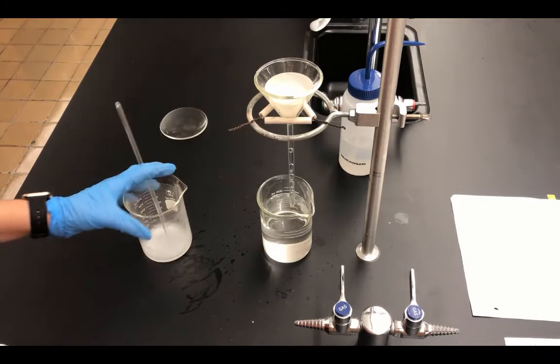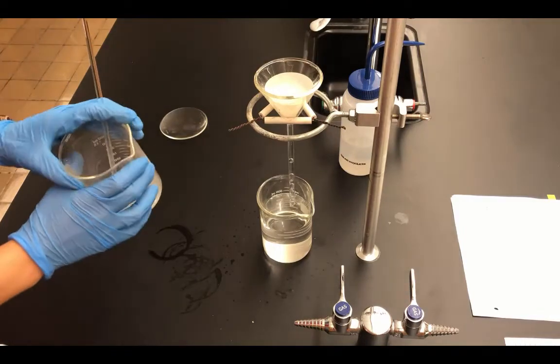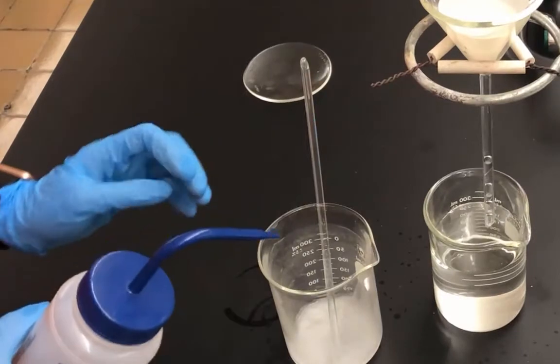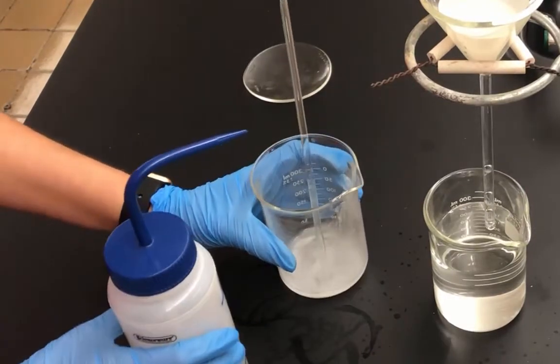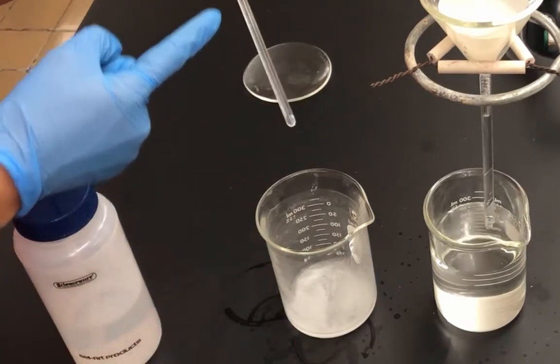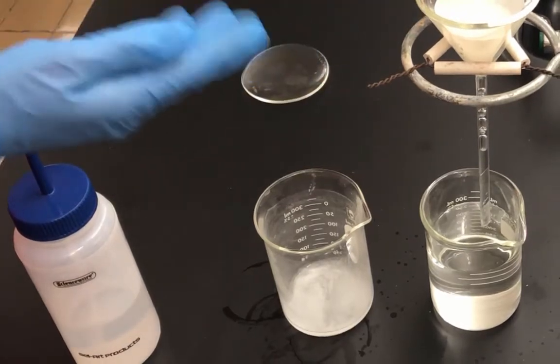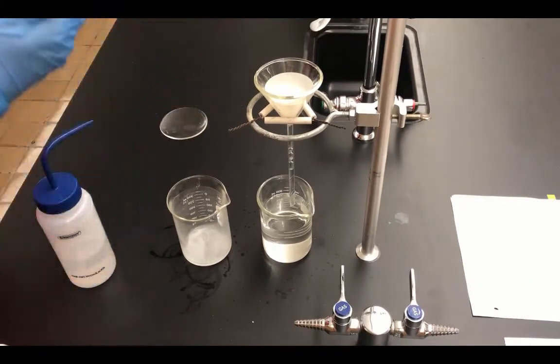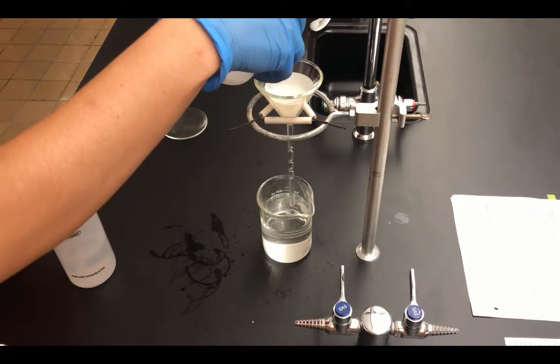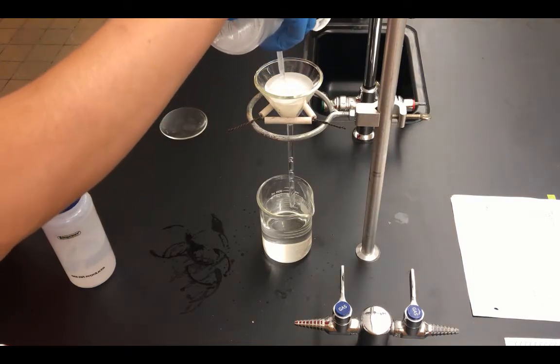Once we get down to essentially the bottom of the beaker that had the precipitated solution, we want to use some distilled water to rinse out the beaker and to rinse out the stirring rod. If you notice the stirring rod has some white solid on it, that's going to be the last thing that we rinse into the filter, because we're going to continue to use this. So we want to make sure we pour out the rest of the solution down the stirring rod.